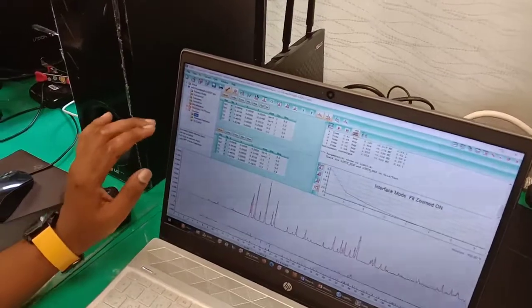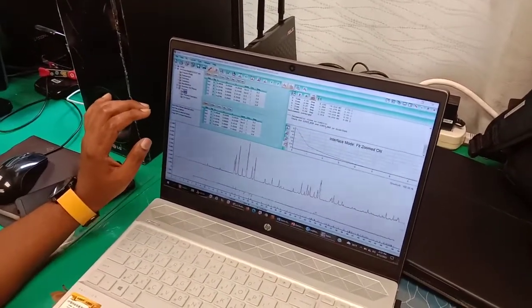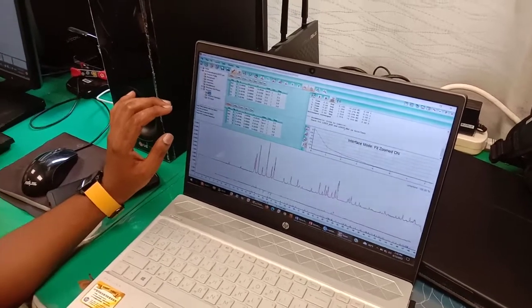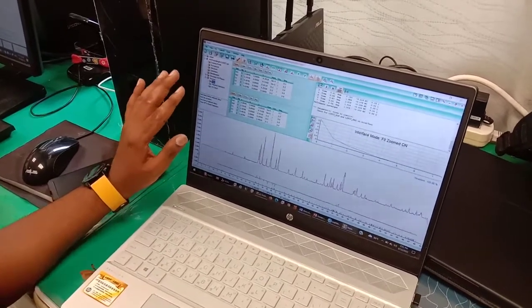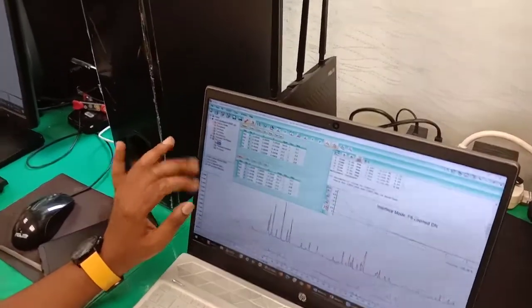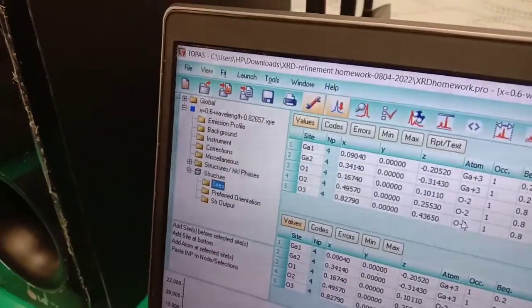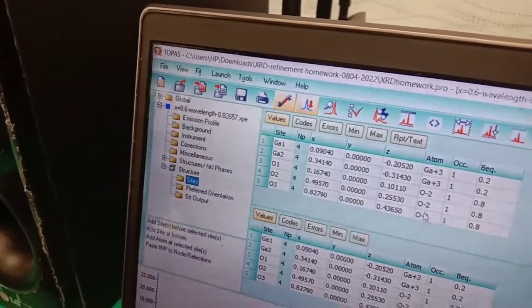At the same time, sometimes you have 20 or 25 and will still refine the sites, in some special cases. When you go for the sites, you have to look for two things. One, special positions, whether this system has special positions like 0.5, 0.25, 0.75, 1 or 0.33, some kind of trend.